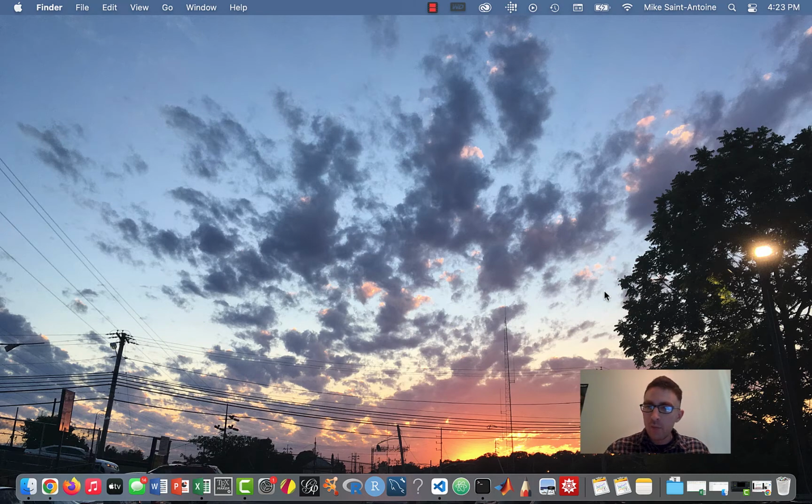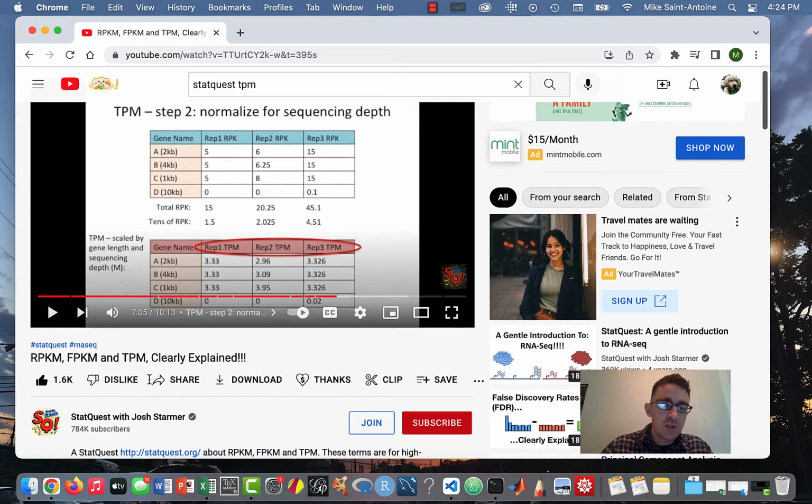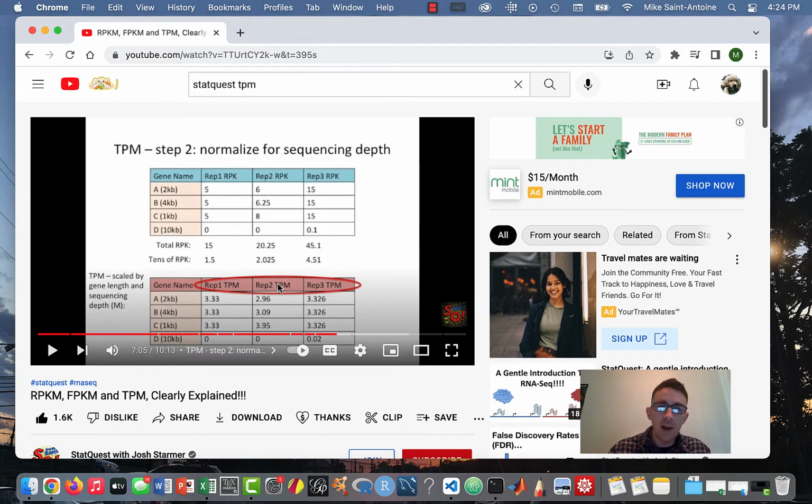Before I get started with showing you the Python code, I first want to recommend a video that explains why TPM is a good normalization technique and why it's preferable to other normalization techniques for RNA-seq. I was thinking if I should try to explain this myself, but I thought this video explains it better than I can. This is from the StatQuest channel, by the way. Really good channel with lots of statistics and bioinformatics videos. If you haven't seen it, check out this video for an explanation of why this is a good normalization technique and a good intuitive, visual explanation.